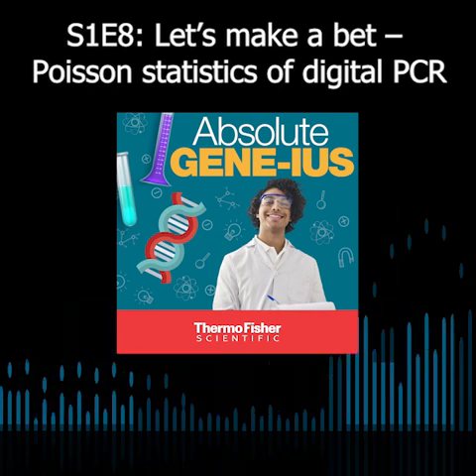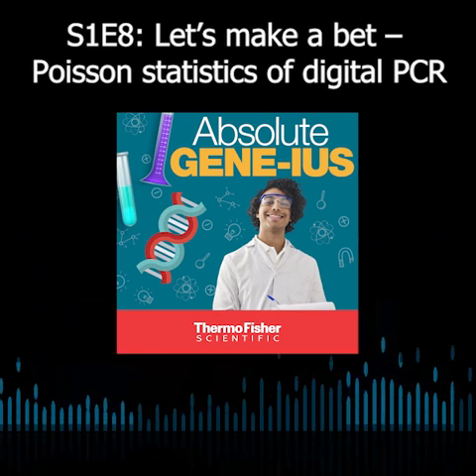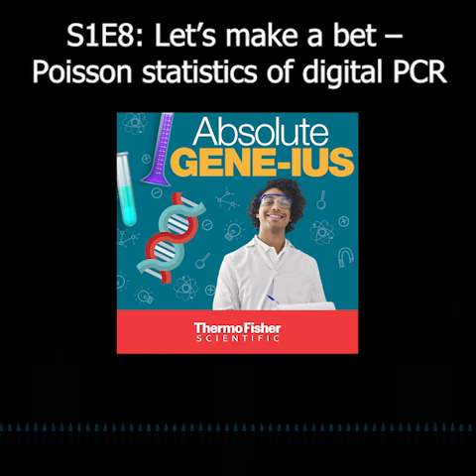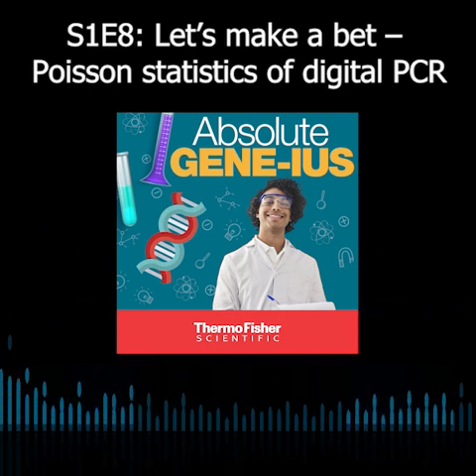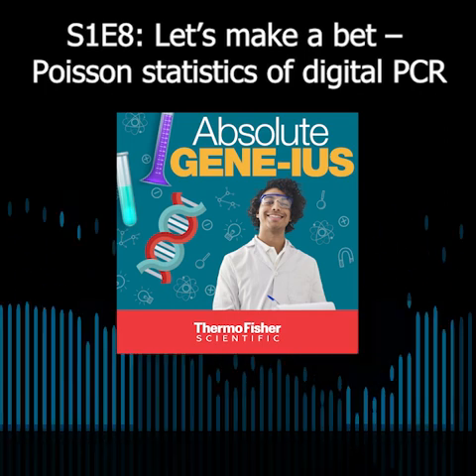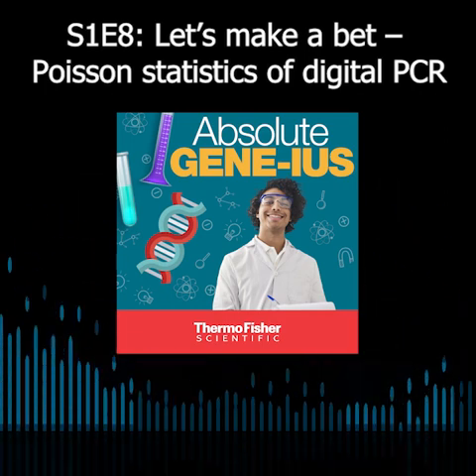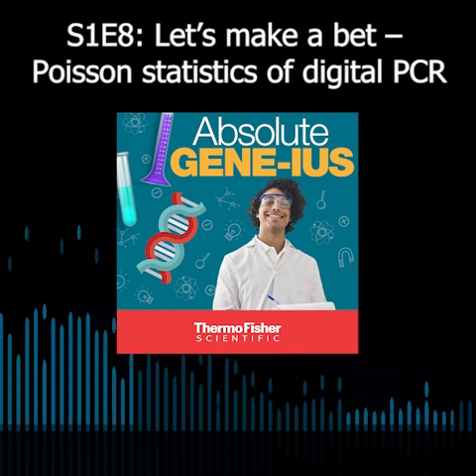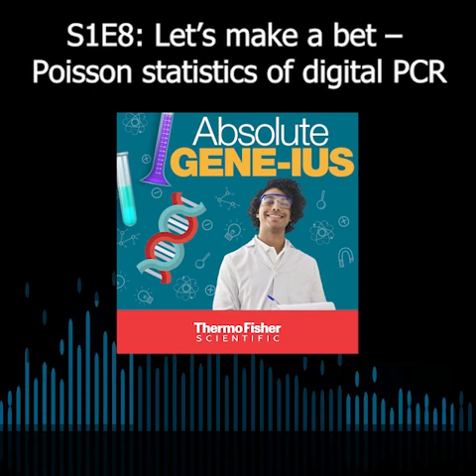Yeah, I think if I had to give an elevator pitch for digital PCR, there'd be a couple bullet points. One, of course, is quantification, absolute quantification. If you want to know the concentration of a target, digital PCR is the gold standard. Real-time PCR can do it. We can talk about some of the nuances there, but absolute quantification is a critical value for digital PCR.